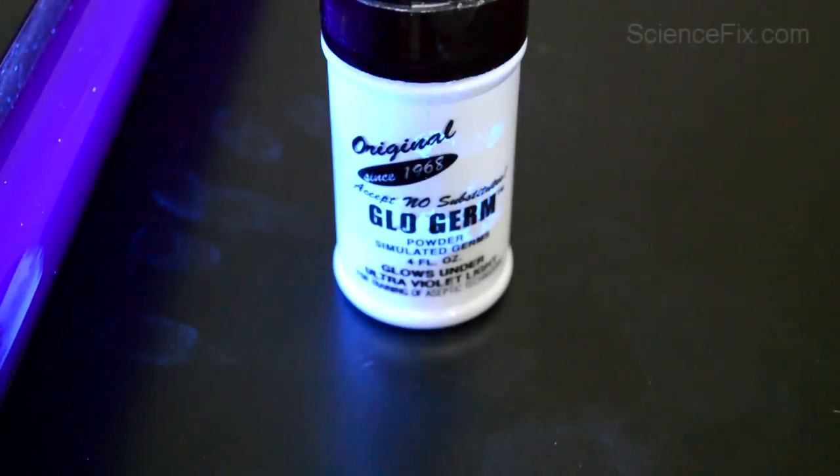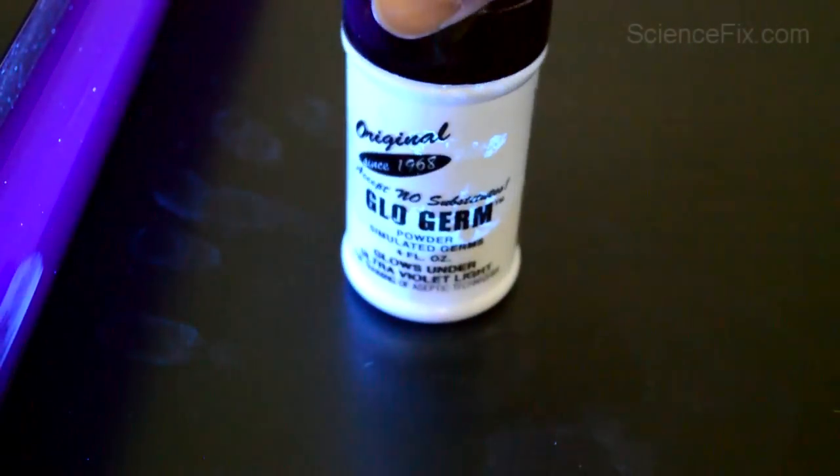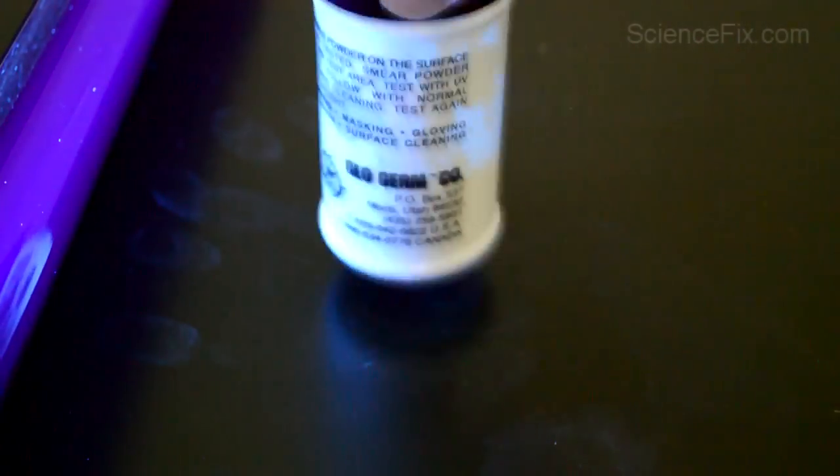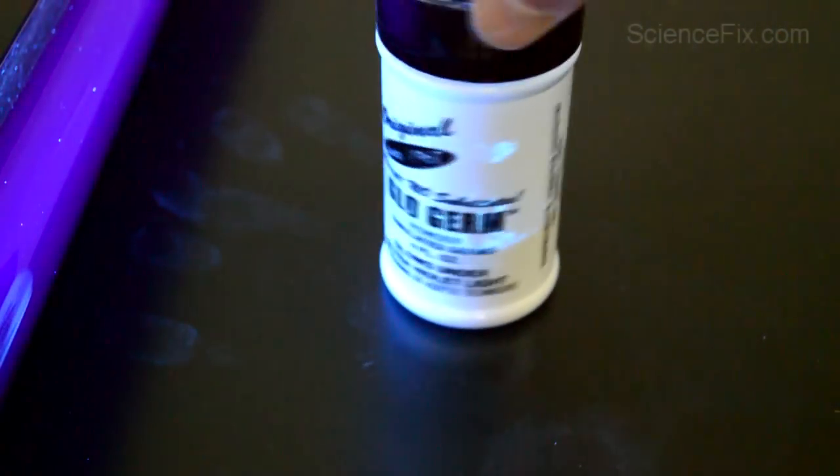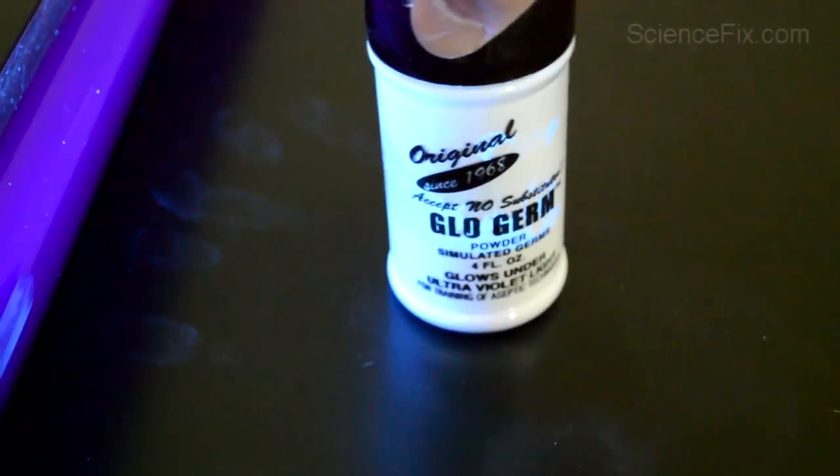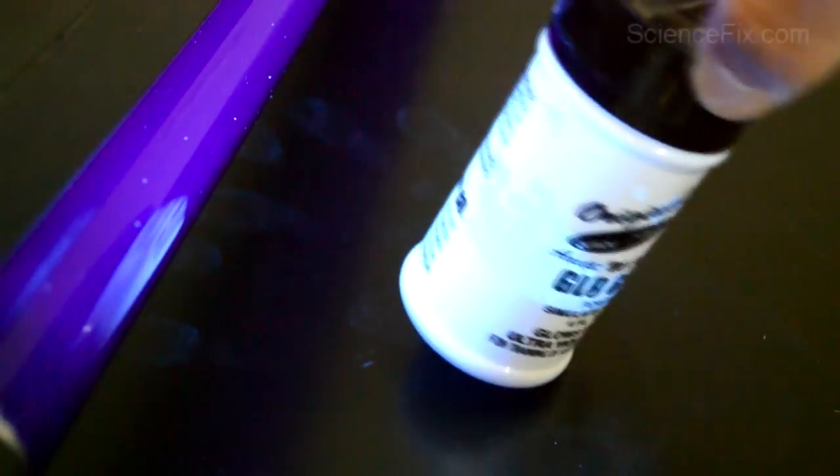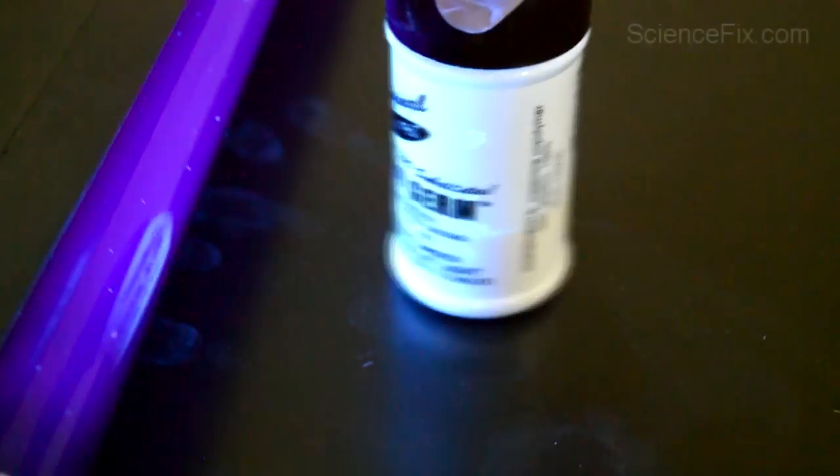It will fluoresce pretty easily. You can see some fingerprints actually on the countertop there. That's some of the glow germ powder that's been on some fingers, so you can see the fingerprints on the countertop. I'll open up the container and pour out some of the glow germ powder. You can see what it looks like.